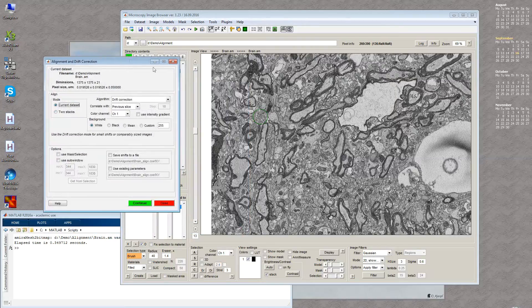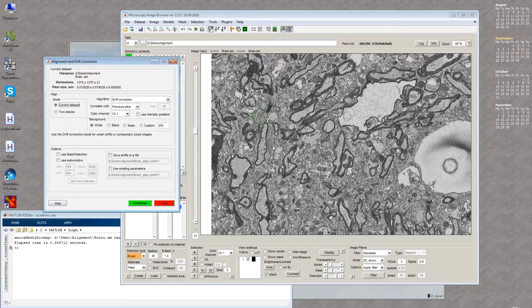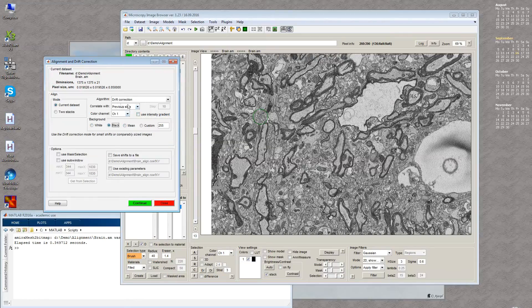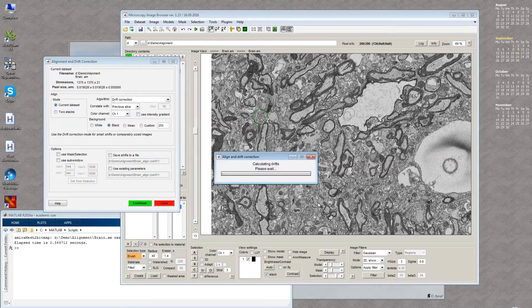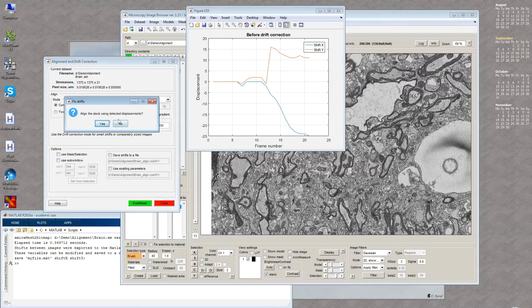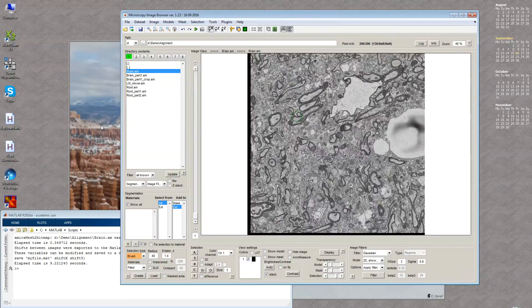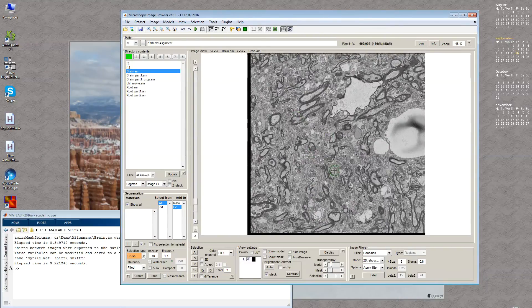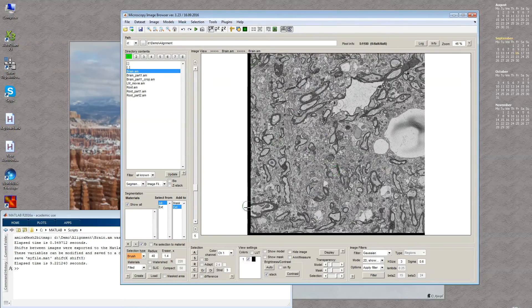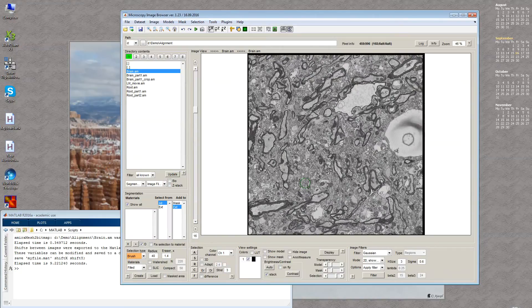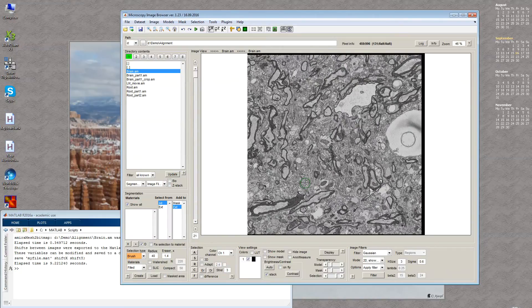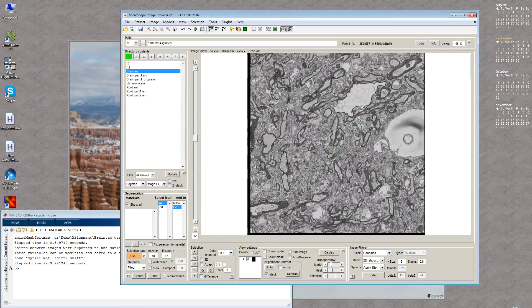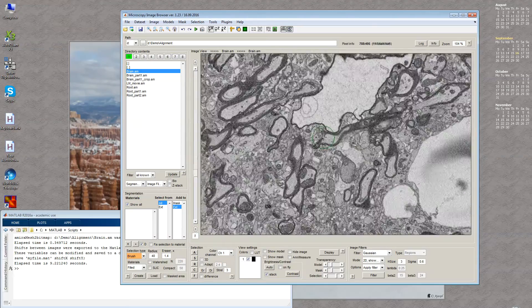Now we have this basic example of brain tissue. I will use black background to show what it means and just use default mode. First the algorithm calculates the shifts and shows them as a plot. If we're happy we can use them, if not we press no. Now I press yes and the dataset was aligned. This black box shows how the image was shifted. We can see now the dataset is aligned with no drift.